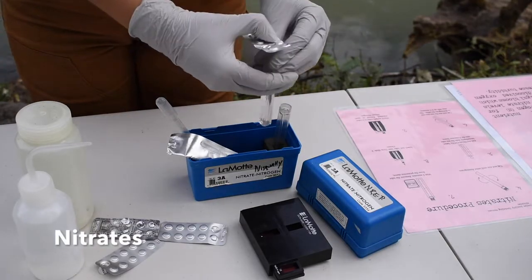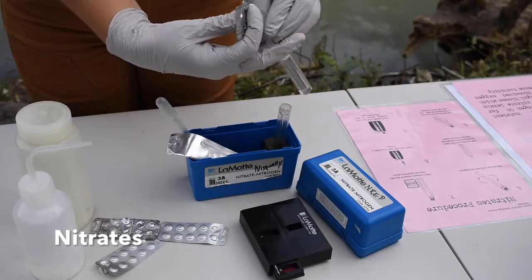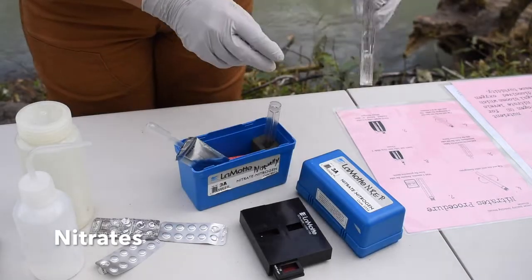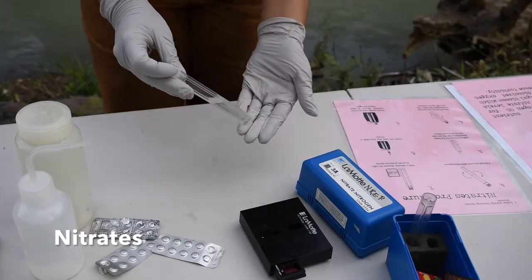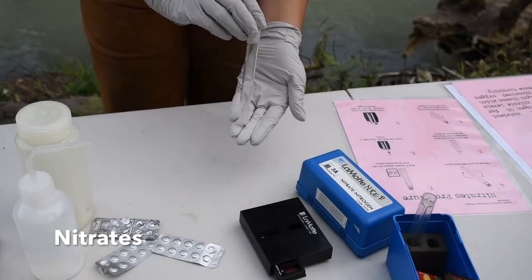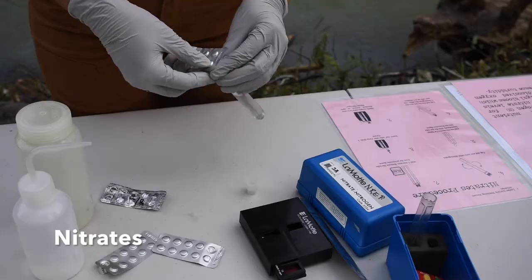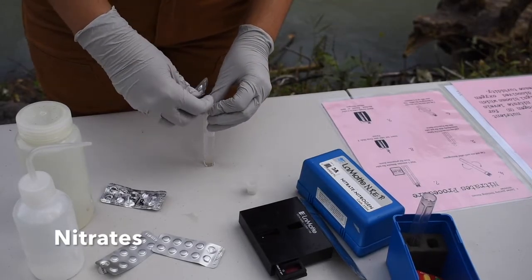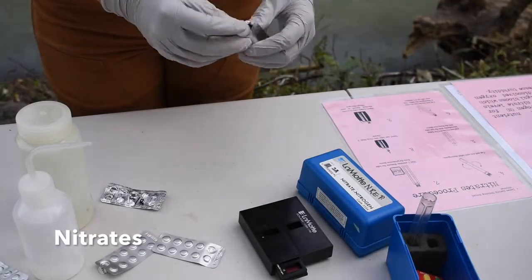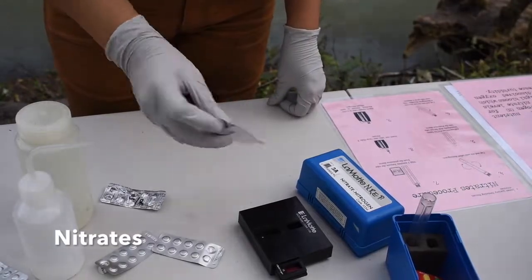Next, we're going to add one nitrate number 1 tablet and cap the test tube and shake it until the tablet is dissolved. Next we're going to add one nitrate number 2 tablet and immediately slide the tube into the protective sleeve. Next we shake to dissolve again and wait 5 minutes.